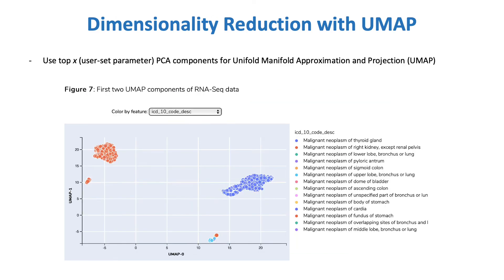Next, dimensionality is further reduced by using the top x PCA components — a user-set parameter — for Uniform Manifold Approximation and Projection, or UMAP, which is useful to accentuate any clustering present. Here is a similar scatterplot as before, now using the two UMAP components.